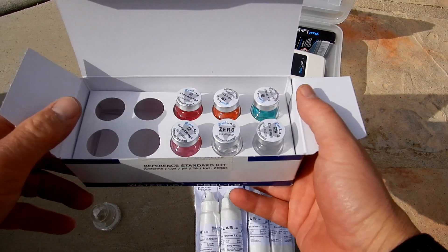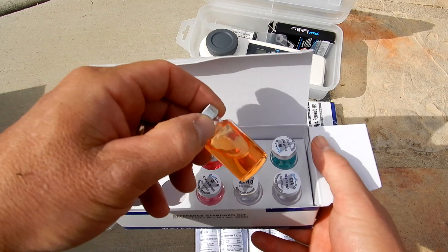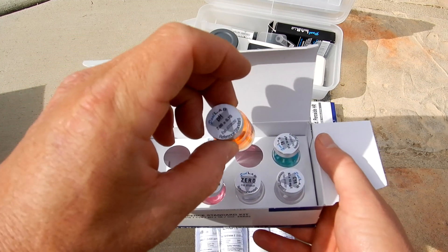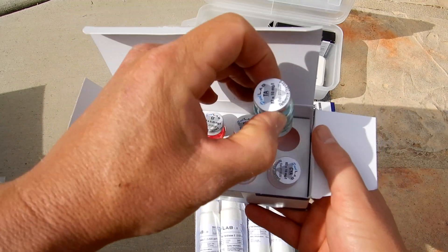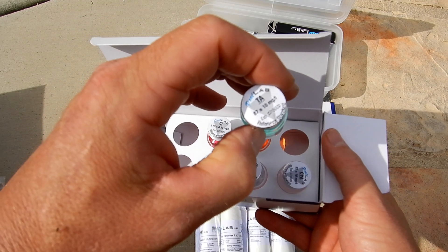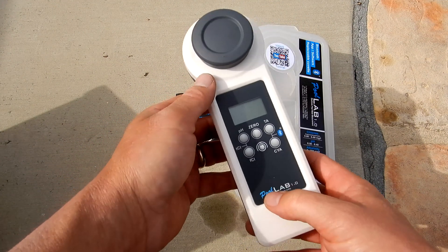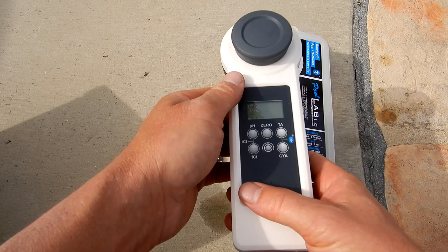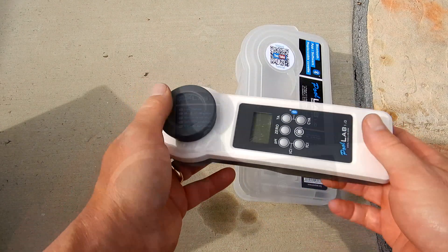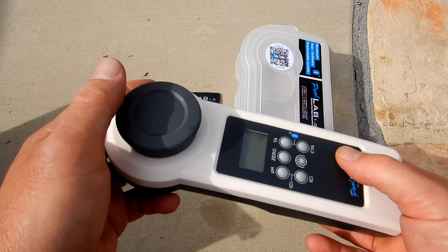You can also order a reference standard kit, which allows you to verify that the PoolLab 1.0 is accurate. For example, there's a pH 7.0 reference standard and a total alkalinity reference. That's a look at the PoolLab 1.0 Photometer Water Tester for your pool and spa — probably one of the easiest photometer water testing devices you can get.